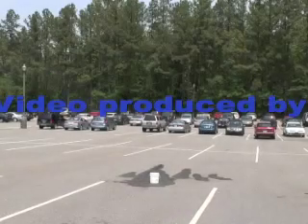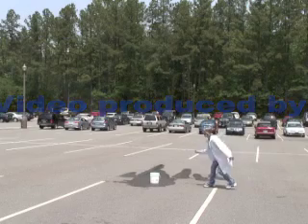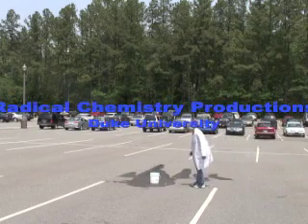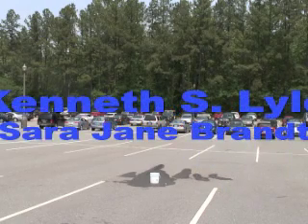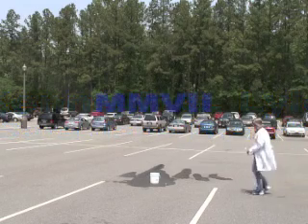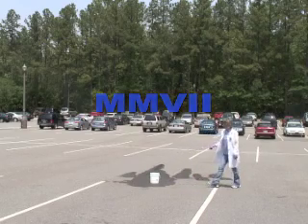Okay, we're recording. Okay, here we go. Careful, that ground is wet. Yeah. Now I'm gonna pick up with tongs. Okay. Ready? We're still recording.